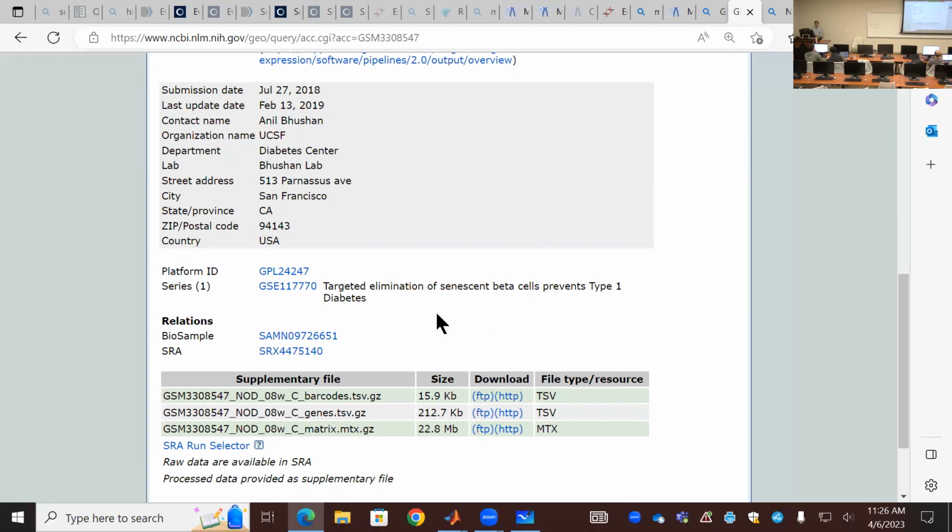signaling. Okay. So my hypothesis is if you don't use this type 1 diabetes mouse, but use healthy mouse alpha cell, you don't get those signals. If that's the case, it's really strong indication that highly variable gene to select not the cell function, but also the active cell activity under its current environment. Okay.